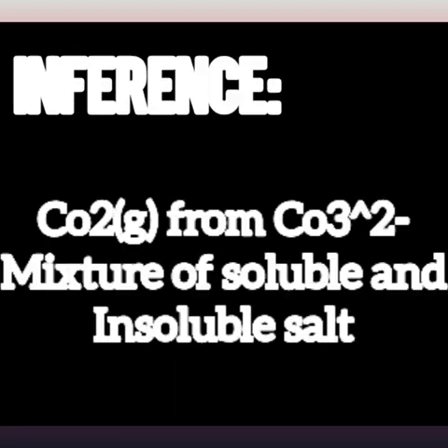Now for your inference, CO2 gas from CO3 2-. For the mix, you need to add that it's a mixture of a soluble and insoluble salts. When you combine them together, it's like partially dissolved. You understand? So it won't really dissolve. So it's a mixture of soluble and insoluble salts combined.